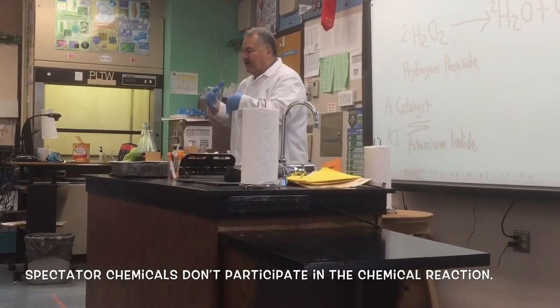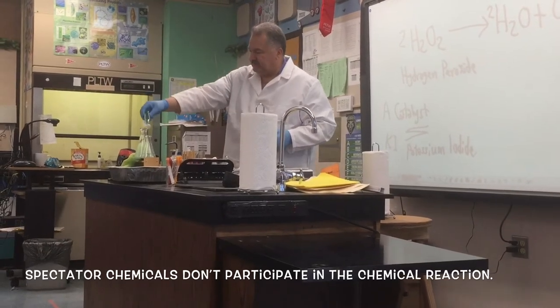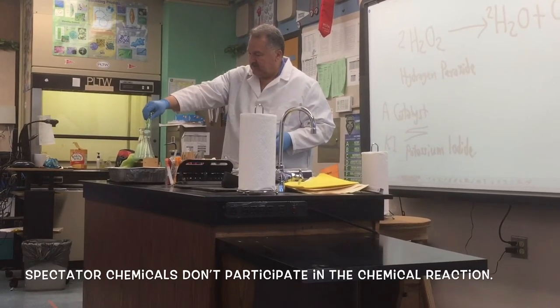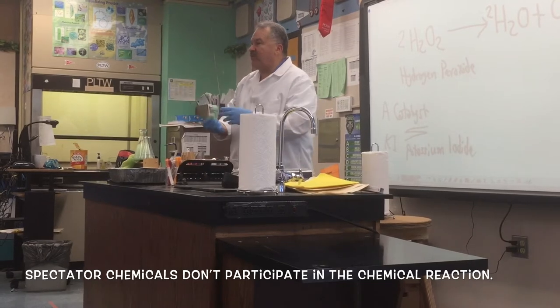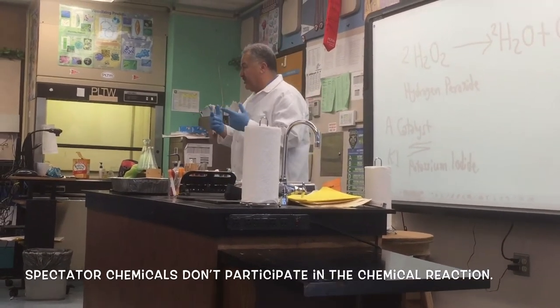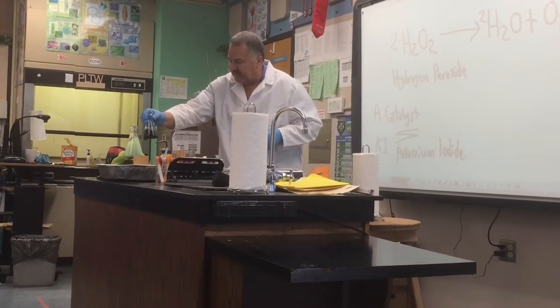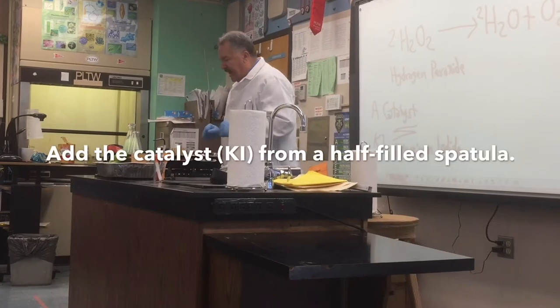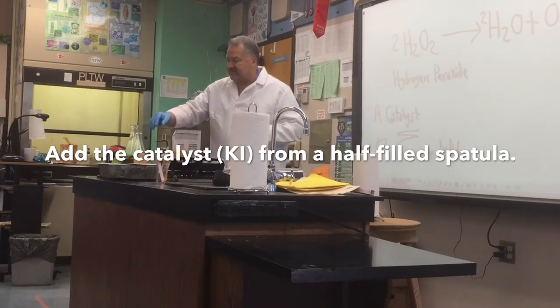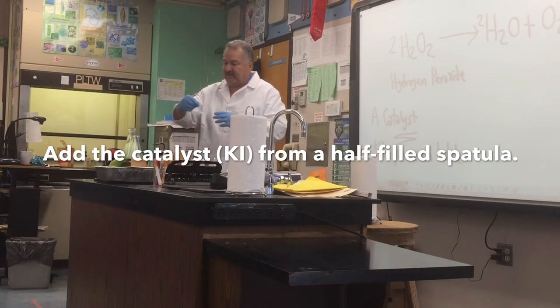What do I need to capture the whole thing? The soap. Here. What do you call the soap and the colors? They're not going to participate in the chemical reaction. Spectator chemicals, all right? So we're going to mix it thoroughly over here. Okay, one is missing. What is the other chemical? A catalyst. Good job, Ryan.